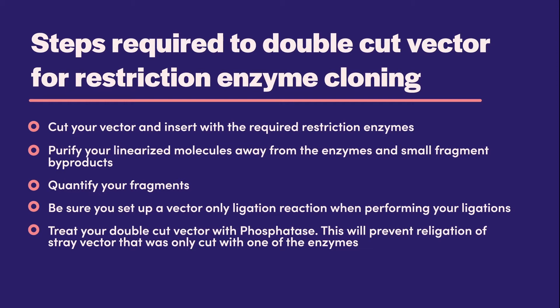Successful restriction cloning using two restriction enzymes starts with abundant double cut vector that has minimal background, as well as clean fully digested insert. Cut your vector and insert with the required restriction enzymes. Purify your linearized molecules away from the enzymes and small fragment byproducts. Quantify your fragments. Be sure you set up a vector-only ligation reaction when performing your ligations. Optionally, you can treat your double cut vector with phosphatase, which will prevent religation of stray vector that was only cut with one of the enzymes.